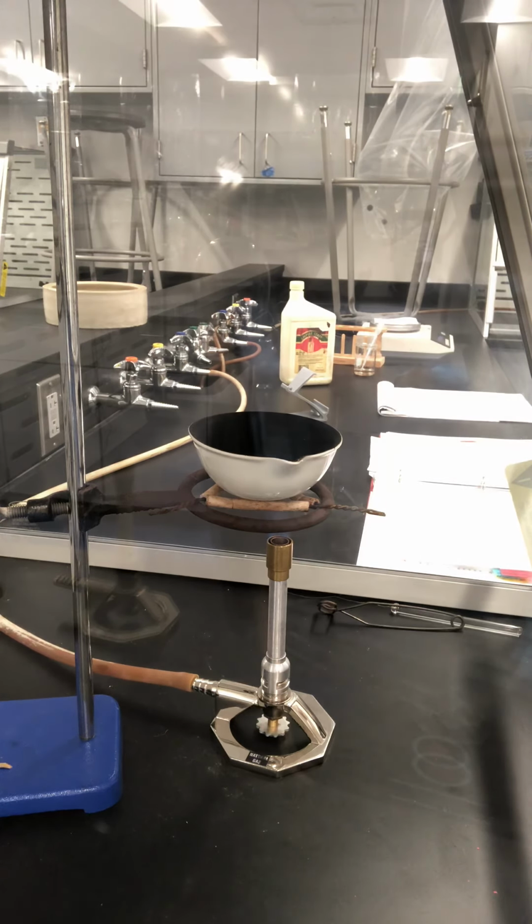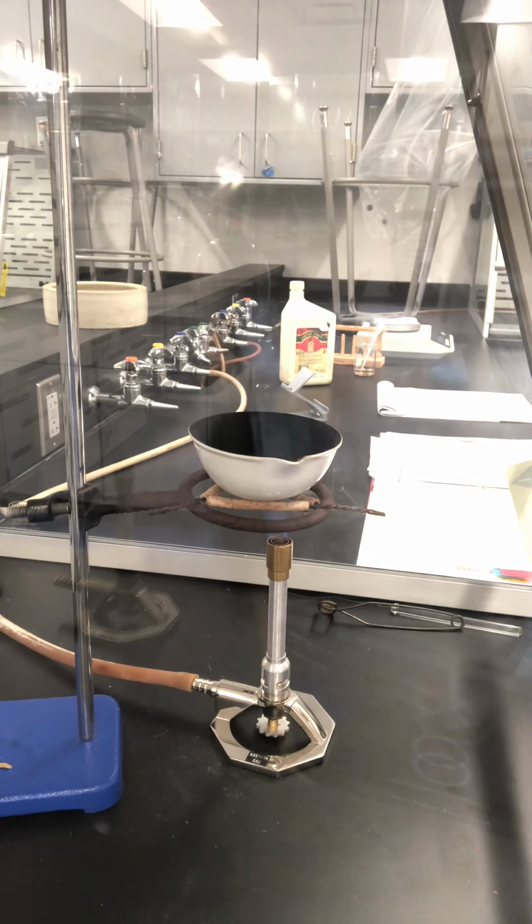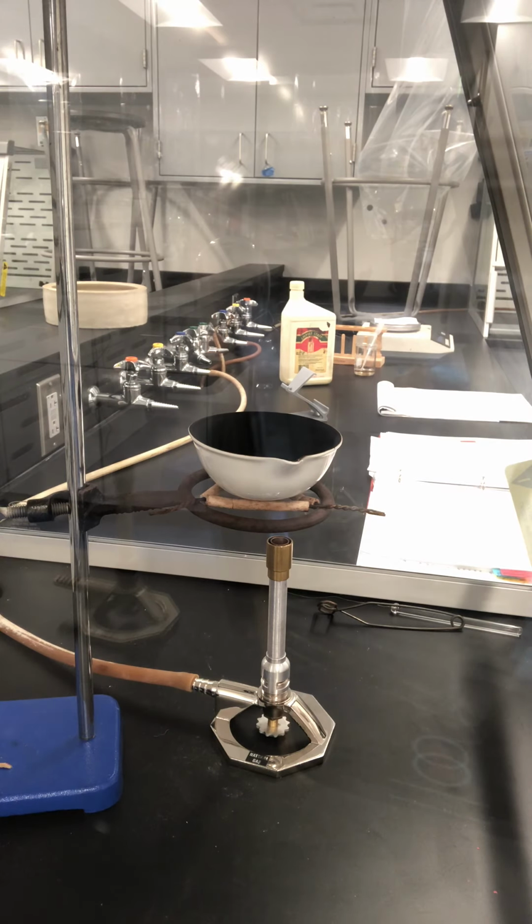And remember when we were just burning the oil, it produces sulfur dioxide. At that time, metal additive will react. Some part of the metal additive will react with the sulfur dioxide, the combustion product. However, we cannot be 100% sure all the metal additive has reacted with sulfur dioxide. If there is some leftover metal additive that doesn't turn into sulfated ash, adding extra sulfuric acid will solve that problem.